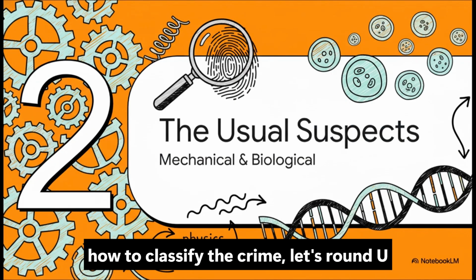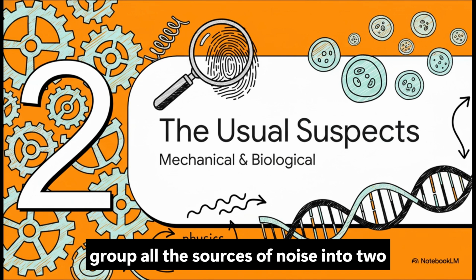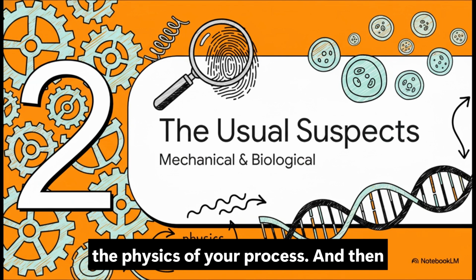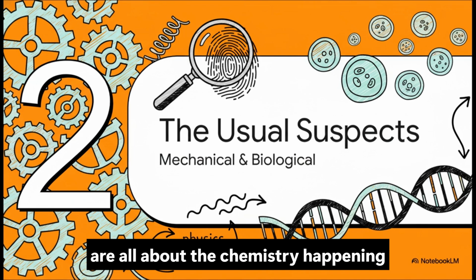All right, now that we know how to classify the crime, let's round up the usual suspects. We can pretty much group all the sources of noise into two main categories. You've got your mechanical vectors, those are all about the physics of your process, and then you've got your biological vectors, which are all about the chemistry happening inside the well.